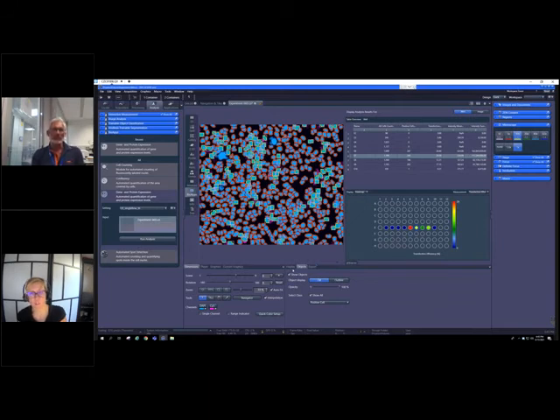Yeah. So you're referring to the coherence contrast, and that's part of the whole AI sample finder condenser apparatus, which has both the LED and the IR light source. So it is a really unique solution from Zeiss. It is a special condenser that goes on our Axio Observer 7, and it's actually quite reasonable in cost.